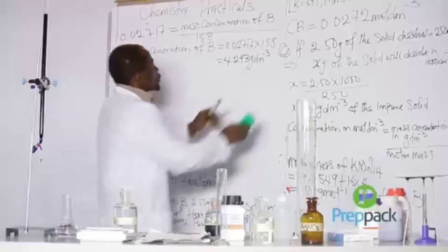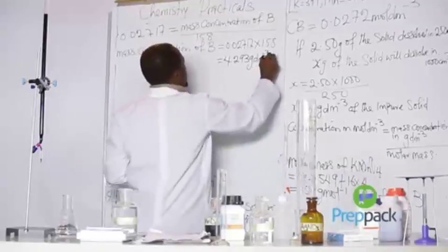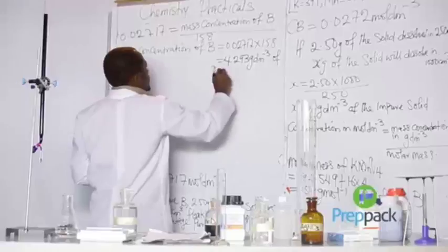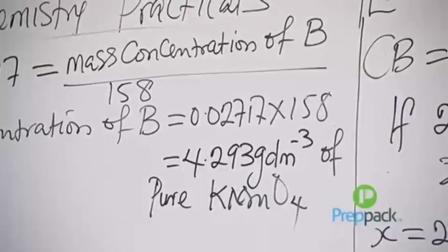So this is the mass concentration of the pure KMnO4. And I am to determine the percentage purity of KMnO4.